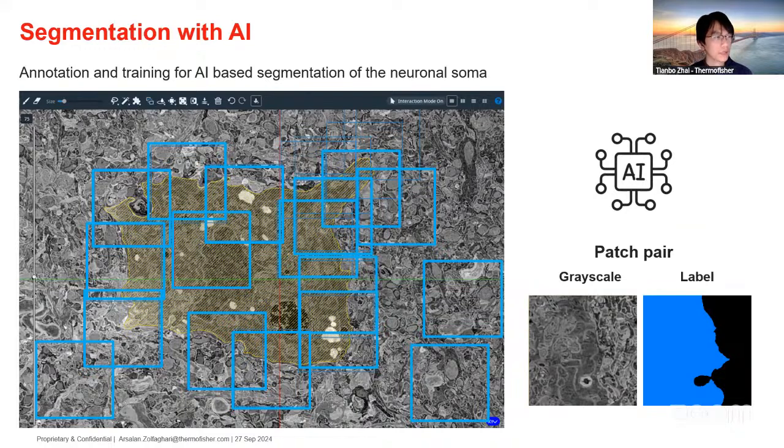Then with the help of that particular model, when it is being applied back to the entire data set, it is going through almost like a voting process, and it's based on probabilities. Whichever has a higher probability will be classified as the structure of interest. We probably will show inside the software and further explain some of the application side of it.